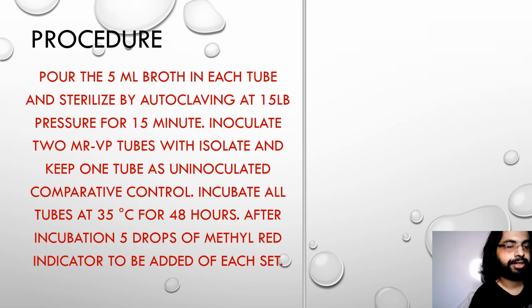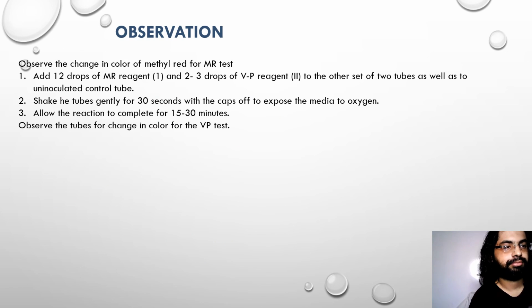After incubation, 5 drops of methyl-red indicator are to be added to each tube of the first set. Observation: observe the change in color of methyl-red for MR test.